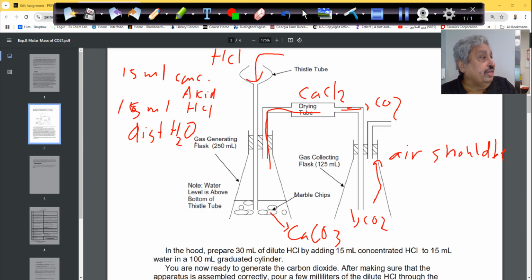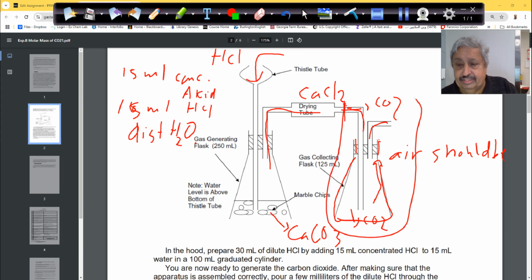We have an oven there, at 70 degrees. You will take this flask here, with this tubing up to here. This part here, take it, rinse it with acetone and put it at least for 15 minutes inside the oven, just to make sure everything is pure and dry. That's the first thing, and this is the major source of error.